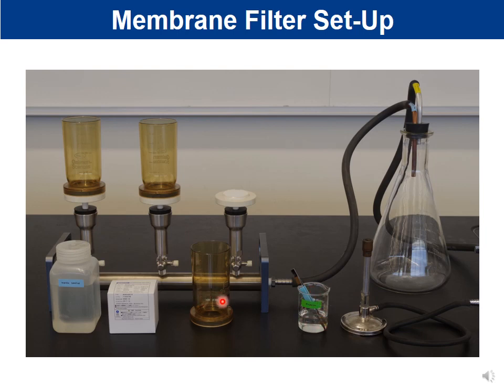And then you would put the lid, this cap, back on. It's magnetic, so it clips on and it will look like this when it's on there. So you have your nitrocellulose, you put the cup collection part back on top, and then you would pour your water through it and continue on with the process. And so I'm going to walk you through the steps that you would do to do this membrane filter setup.